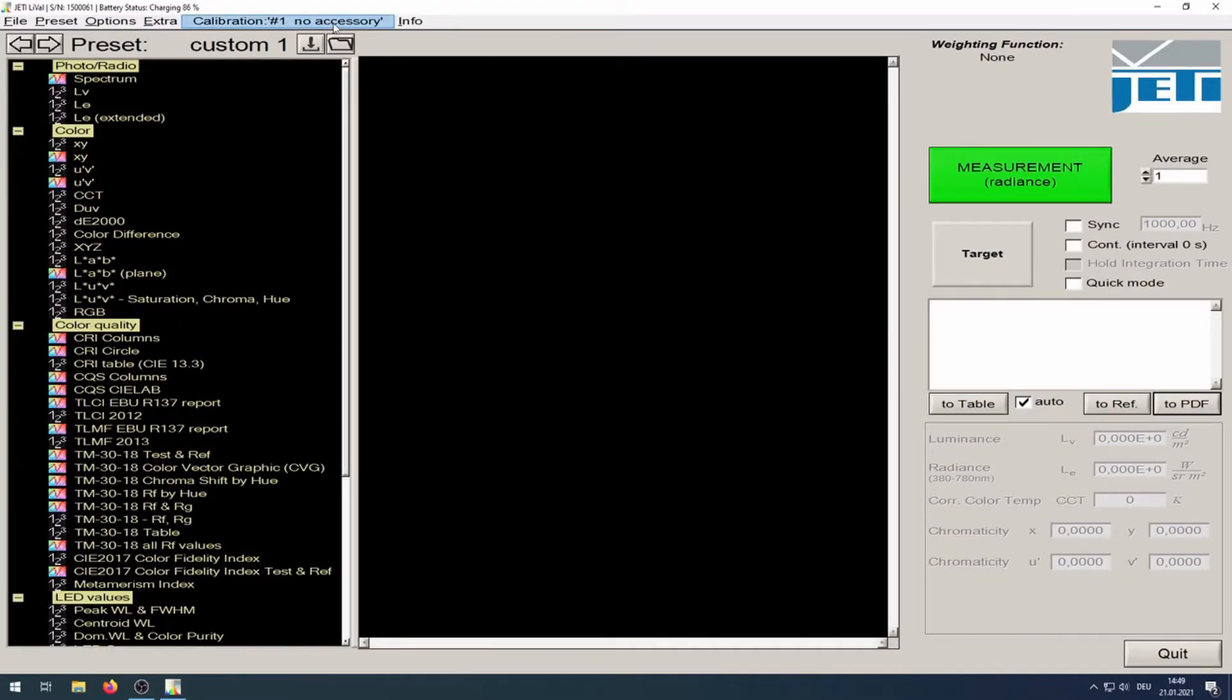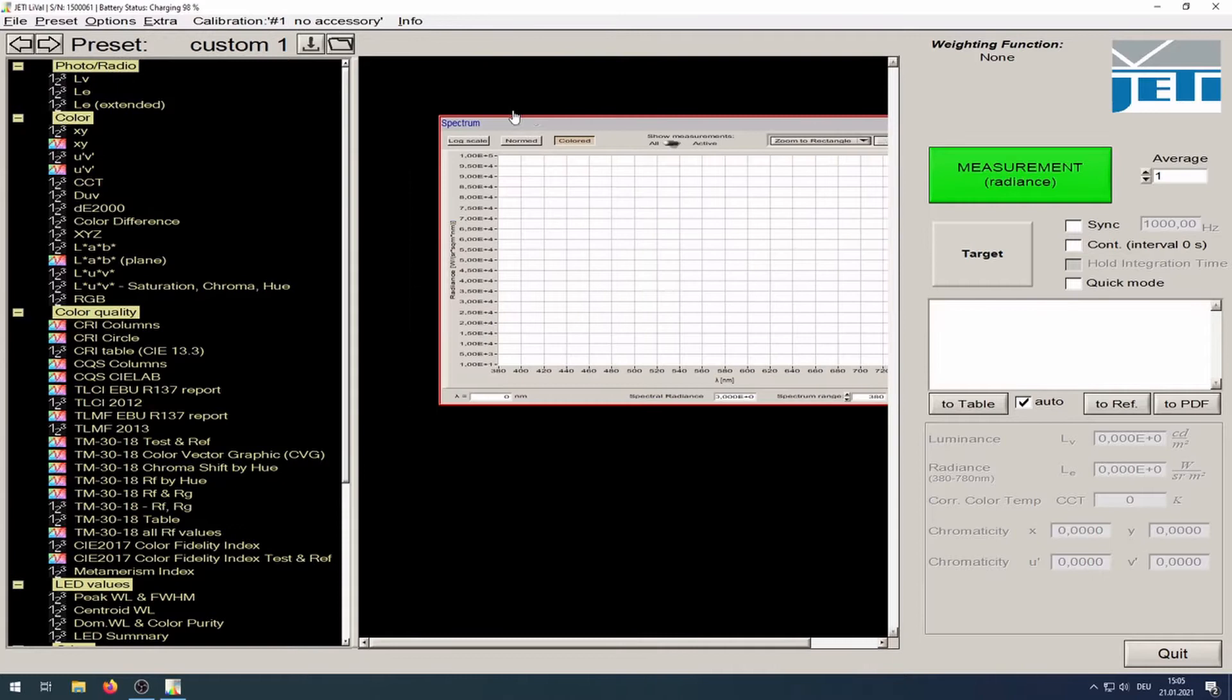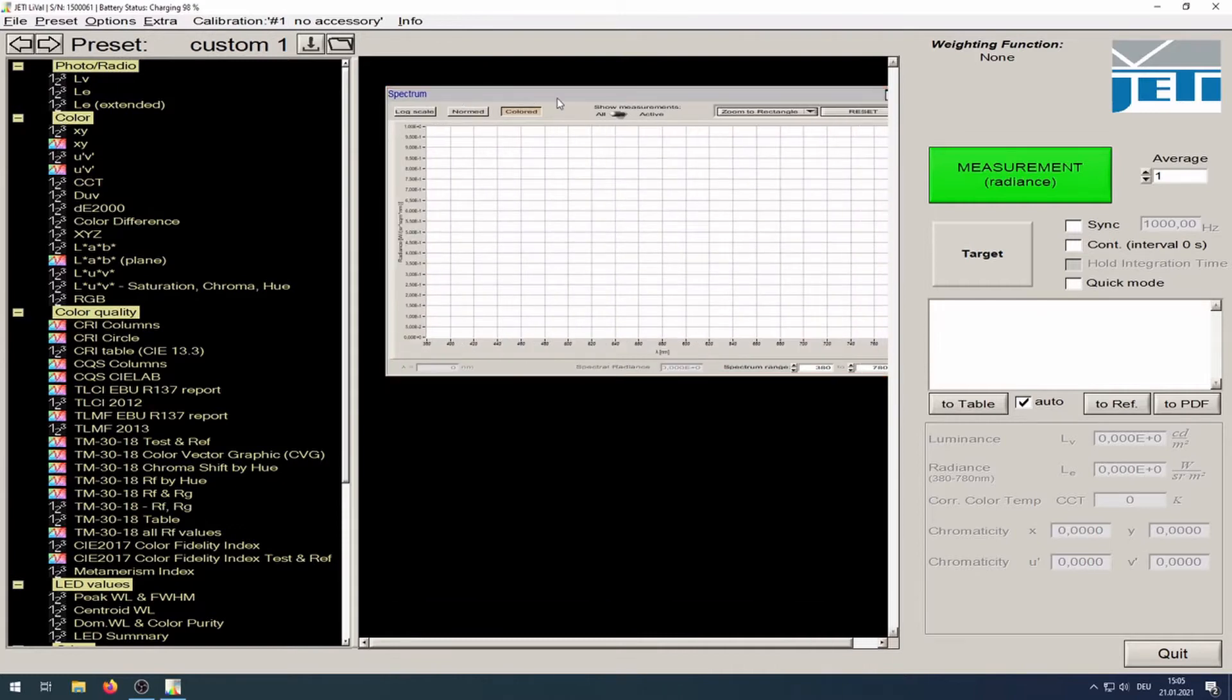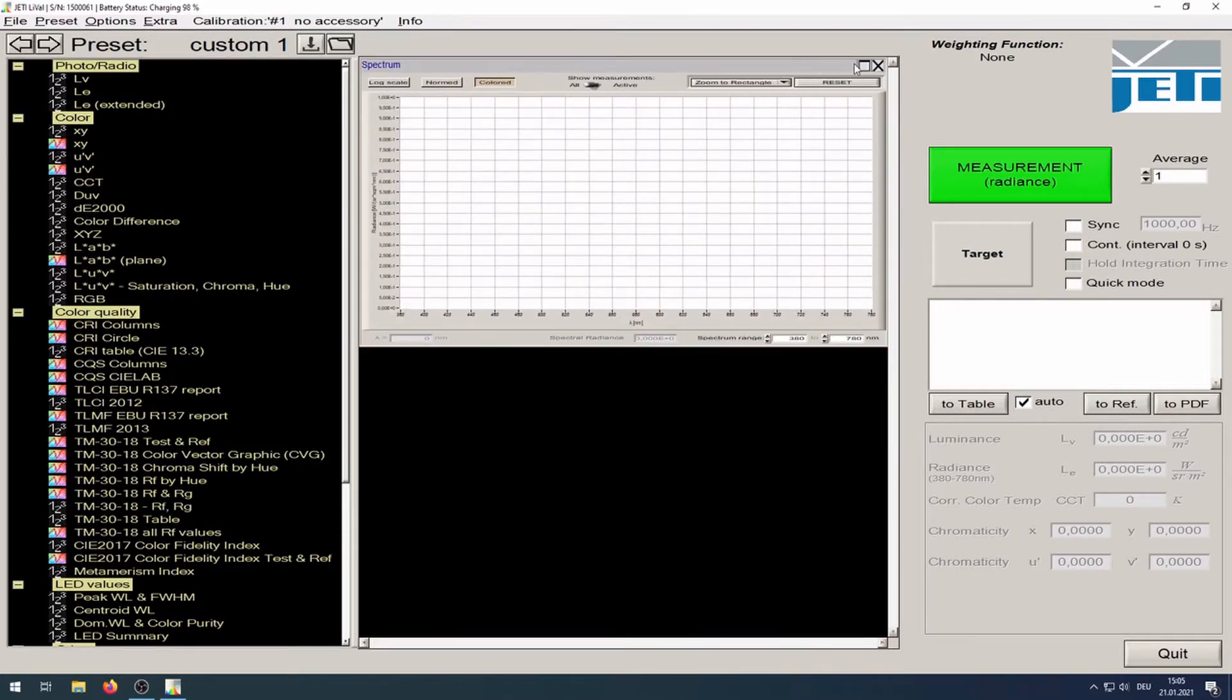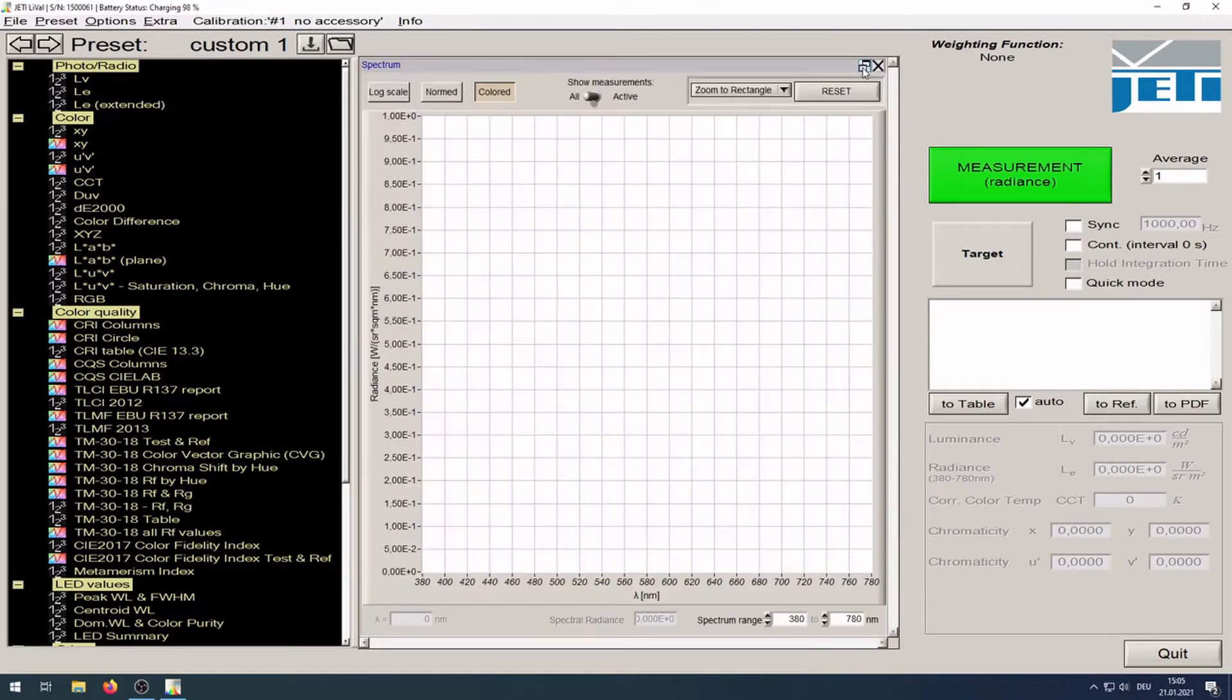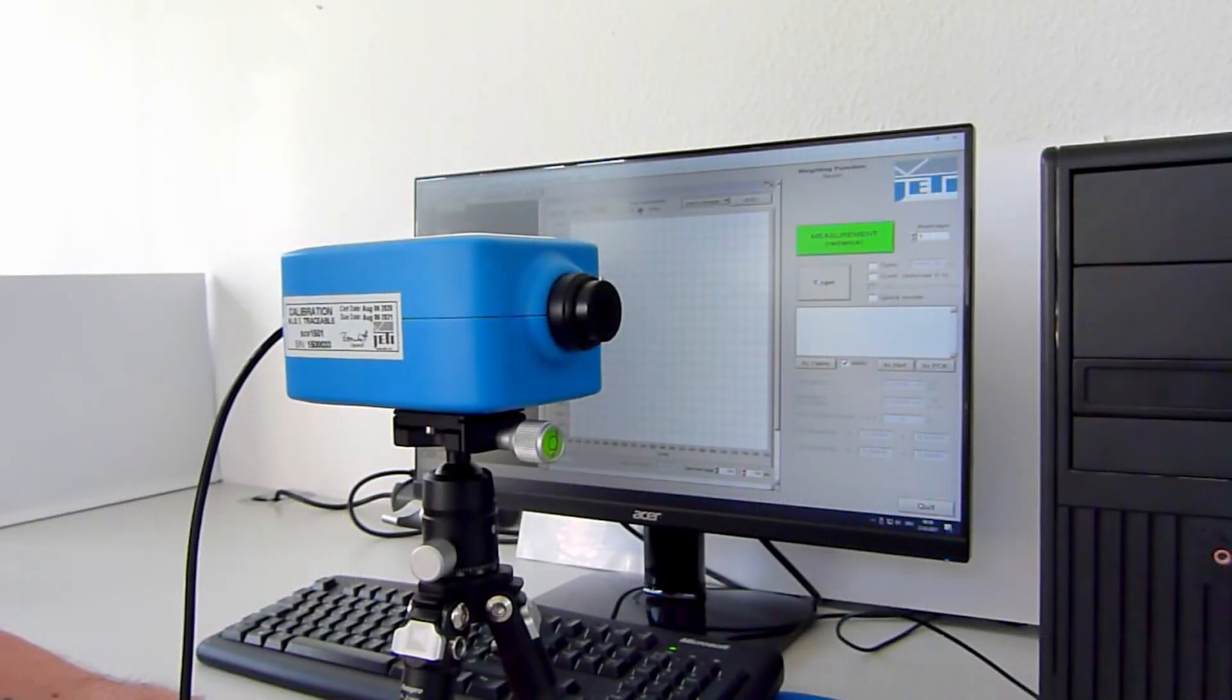You can find this information here. Mode of software is Radiance. Choose an option in the menu, for example Spectrum. Further possibilities to change values you'll find on the left. Do not look into the laser beam or aim the laser at another person.